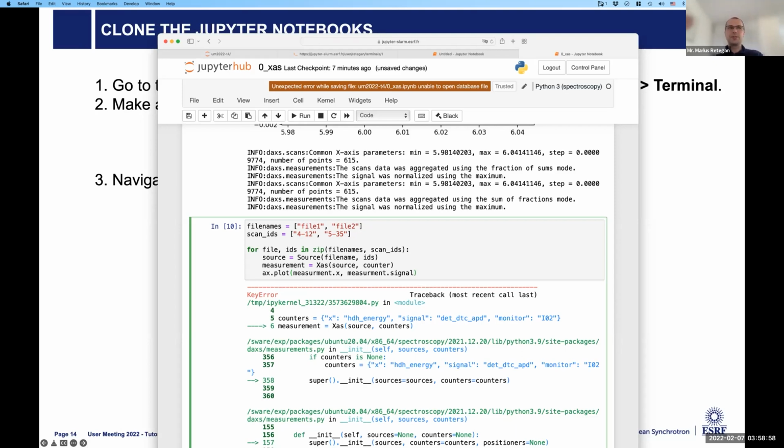I think you're absolutely correct about this, and usually this is why people request, most of the time, graphical user interfaces, because they are simpler. But I believe that if these types of notebooks, like I'm presenting to you today, are in sufficiently large number, people can learn by example, can adapt them to their use case.